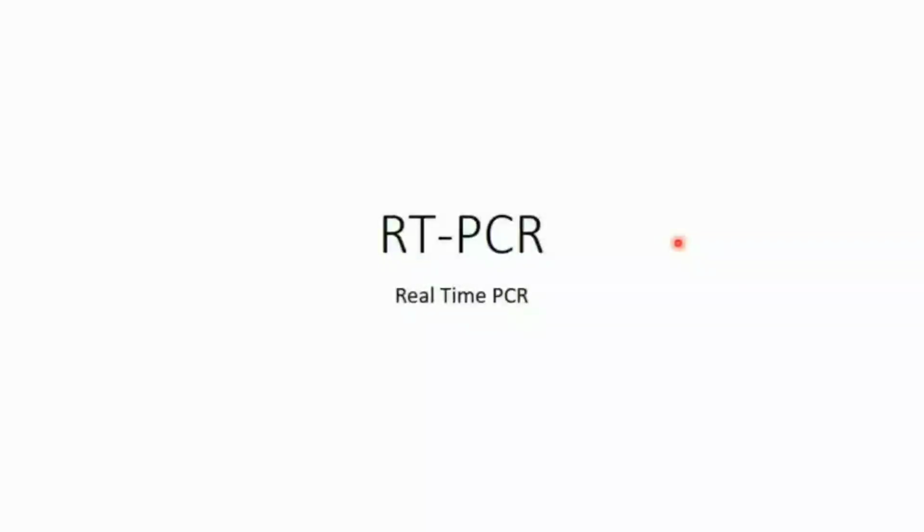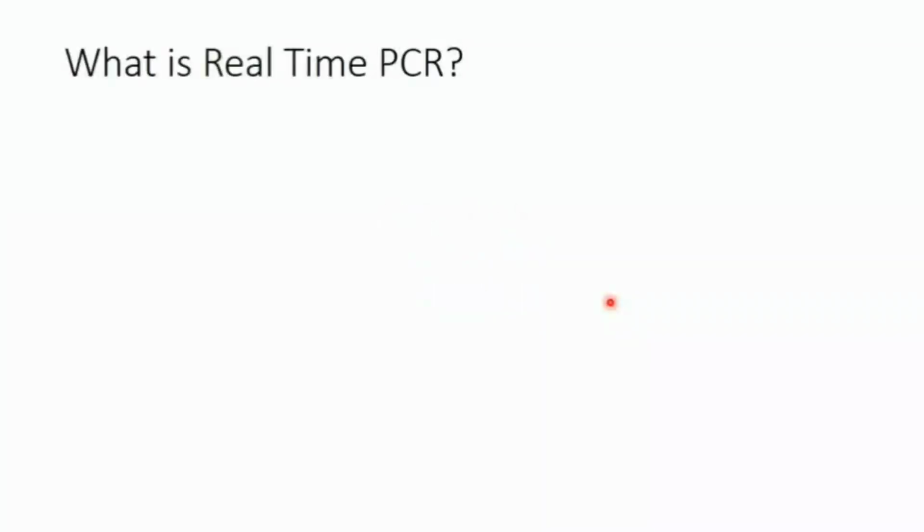Now, in this video, I'm going to speak about real-time PCR, the principle, the technique, how does it go, and everything related. I also will speak about reverse transcription because it's used widely in real-time PCR, and also the data of real-time PCR. So as usual, let's start by asking what is real-time PCR. Real-time PCR is basically a modified technique from PCR.